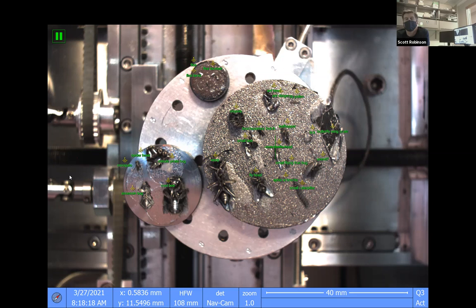So when we got our new electron microscope in October 2015, this microscope that we're using right now, it has been very difficult to run Bugscope on because of the way that it's set up. The software is not nearly as robust as we want it to be. And so Bugscope is still a little bit flawed. So I'm having people, of course, help us work on that, but it's been almost six years. Bugscope is not as good as it could be.